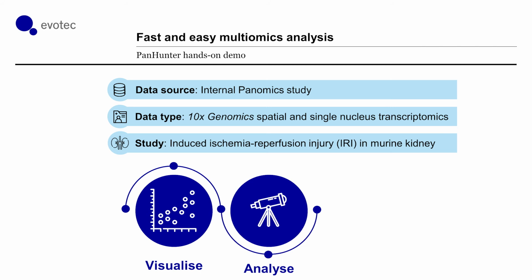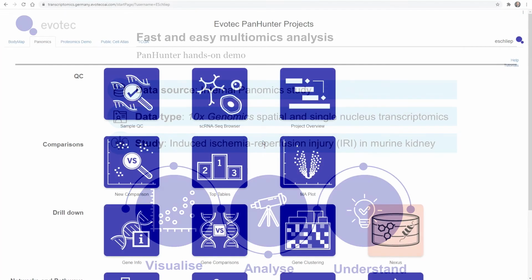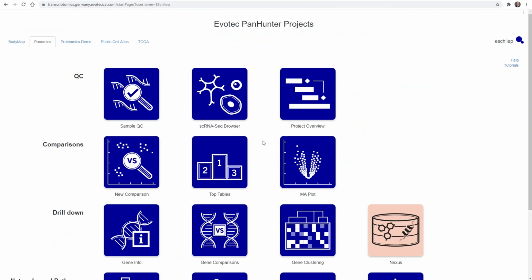In the next couple of minutes, we will look for marker genes of inflammation, kidney injury, and fibrosis and their regulation. Afterwards, we will combine both datasets to gain higher resolution and look for spatial differences on the transcription level across the kidneys. Finally, we will try to find individual stages of disease progression.